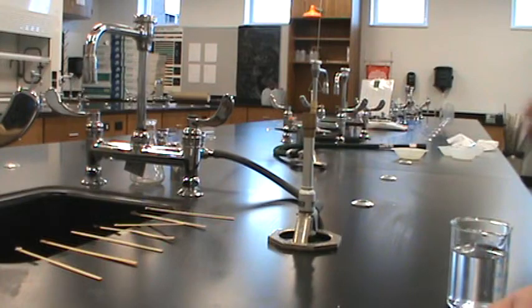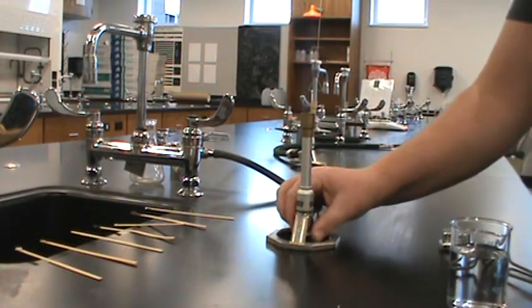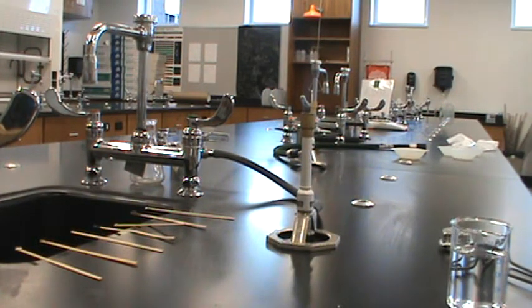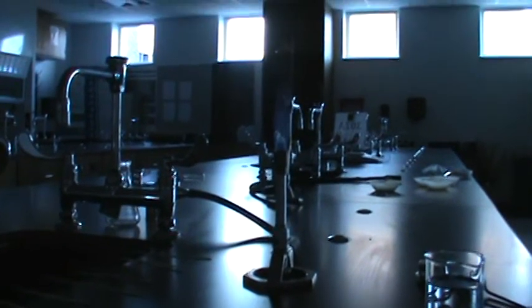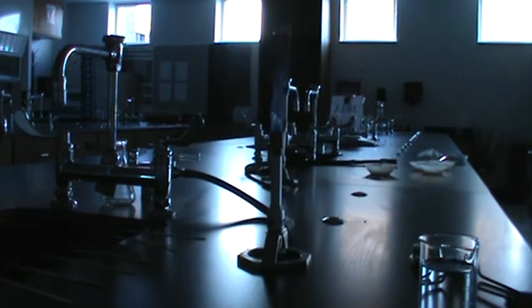Alright, let me turn off the light so you can see the colors a little bit better. Okay. Let's see if this kind of works.